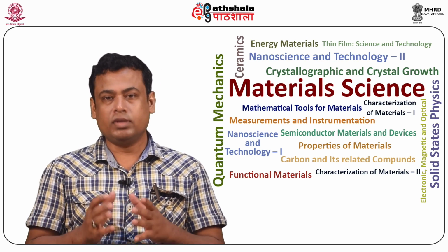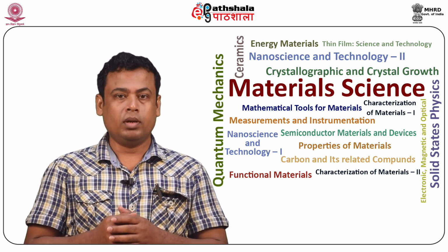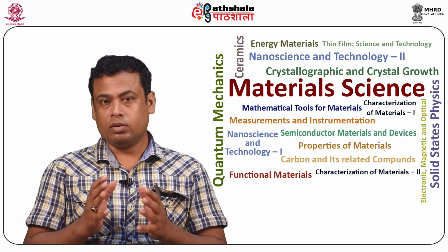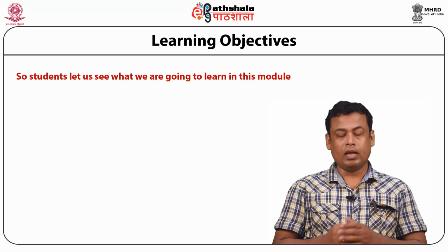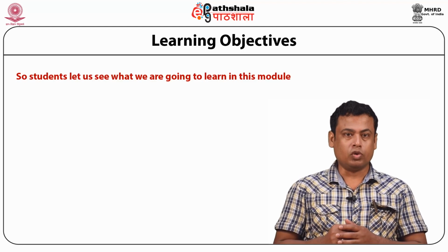Today we are going to discuss the module Atomic Force Microscopy Part 2, which comes under the unit Surface Morphology from the paper Characterization of Materials 2. So, students, let us see what we are going to learn in this module.